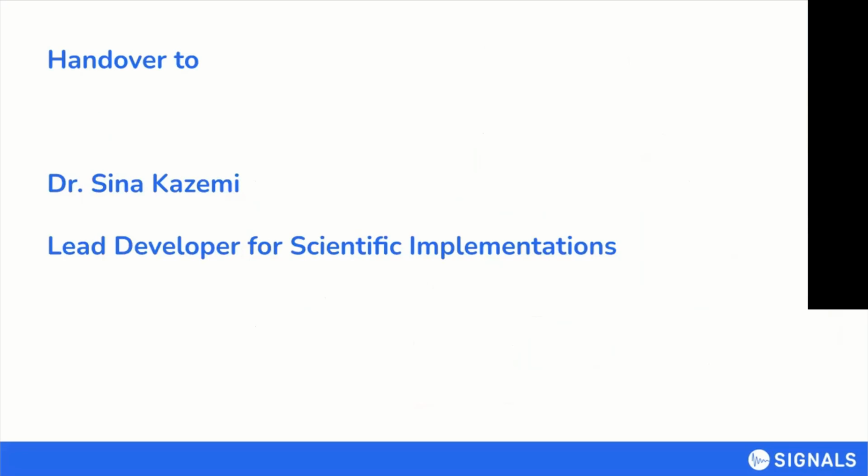Okay, another very important deal for this is not just the entry via the ELN or automated from the instruments, but allowing people to maybe download the data using scripts. Python is of course very popular in the community. Do something with it, and then maybe record that with LOGS as well. But I'll let Sina talk about this. This is something that he has headed up as the project leader.